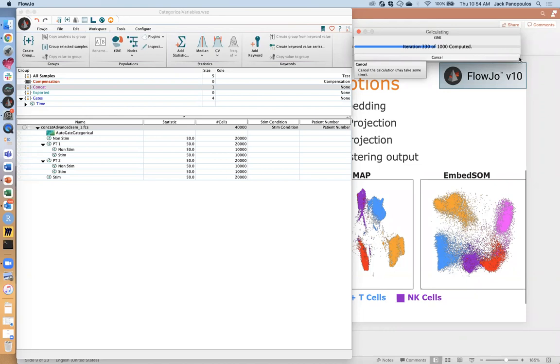And I want to say historically, people were switching over to UMAP because tSNE initially was abysmally slow. And when UMAP came out, I think it was like a 10-fold reduction in the amount of time you had to wait. But I think opt-SNE definitely puts it on par with UMAP, if not better. Then let me clear this out.